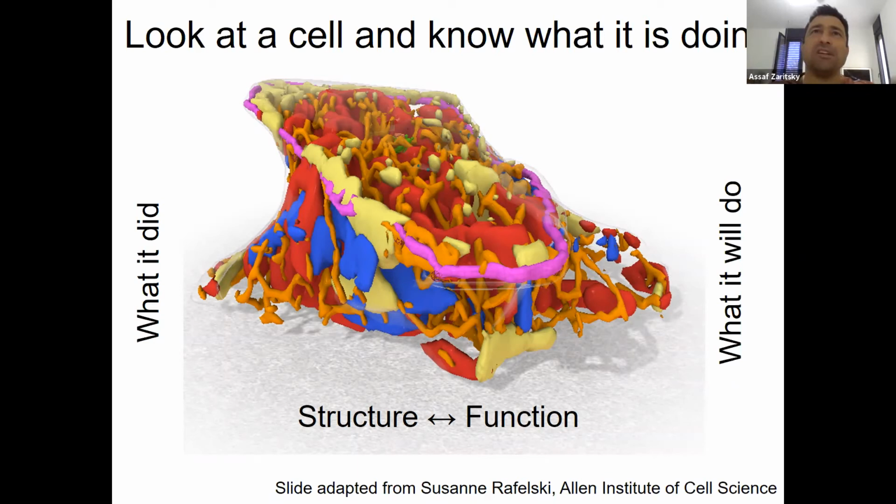You can do snapshots and take your tissue before and after and see that there are many dead cells. But if you want to understand what happens within this tissue and how the cells spread across a population, whether they all die at once, or maybe one cell dies and then it tells its neighbor, hey, you should die now, and then the other, and it propagates. In order to really understand that and link the different molecules to the function, we need microscopy. And the basic question of cell biology is, can we look and understand how a cell is built and what it's doing from its components?